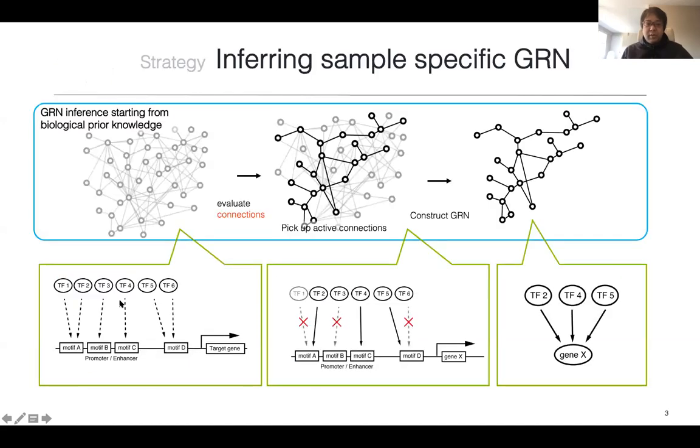Just a brief reminder, our platform CellOracle will use the single cell ATAC-seq data to get the potential regulatory candidate genes. And we are going to use the genomic DNA sequence to get the binding partner of this binding candidate of this transcription factor. So today we are going to use this information.